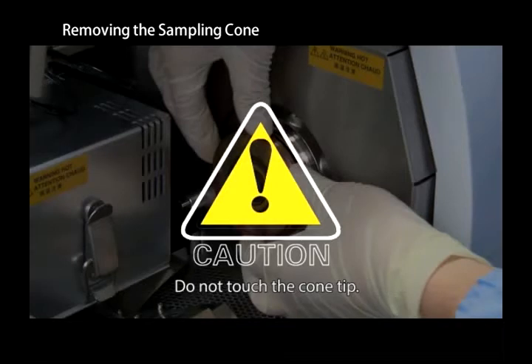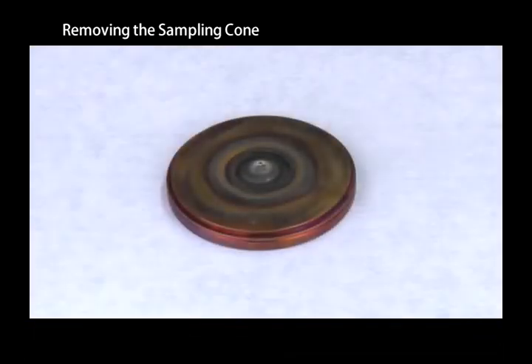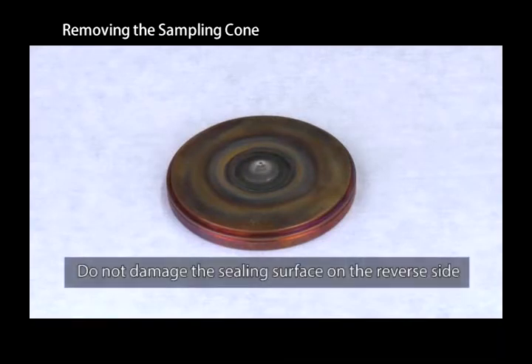Do not touch the tip of the sampling cone — even slight pressure will damage the tip. Make sure to place the sampling cone with the orifice facing up. Take care not to damage the back surface of the cone, as this is the sealing surface.